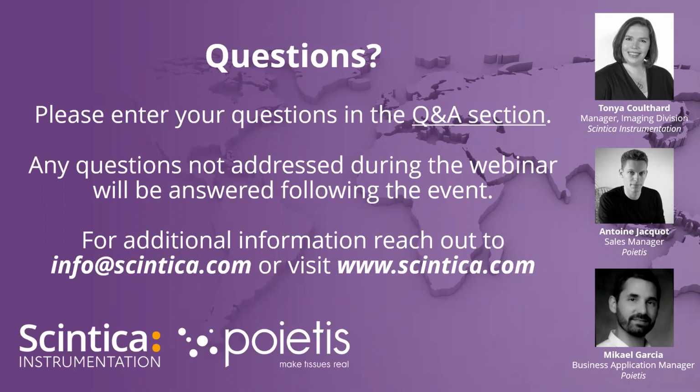Excellent. And it looks like there's an add-on question there. Is there any heat generated when the laser hits the metallized substrate, and therefore affecting the cells? Yeah, I can understand where the question comes from. There is absolutely no problem with heat whatsoever. The laser beam itself never touches cells. This is something that people are usually afraid of, and they think this might at some point impact the viability or the cellular integrity, but it's definitely not the case. We're just using laser beams to create a kind of cell ink bubble, using pressure with the ribbon so that a jet of cells in their media is ejected from the substrate to a receiver. So there's no problem with heat at all.